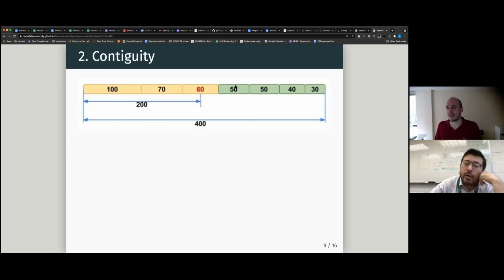One thing you can imagine is that this estimate is going to plateau after a while, right? Because chromosomes have a maximum size. So depending on your genome size and your number of chromosomes, these values are going to plateau. It expresses a lot of weird behaviors in different situations. That's why it's kind of tricky to use.